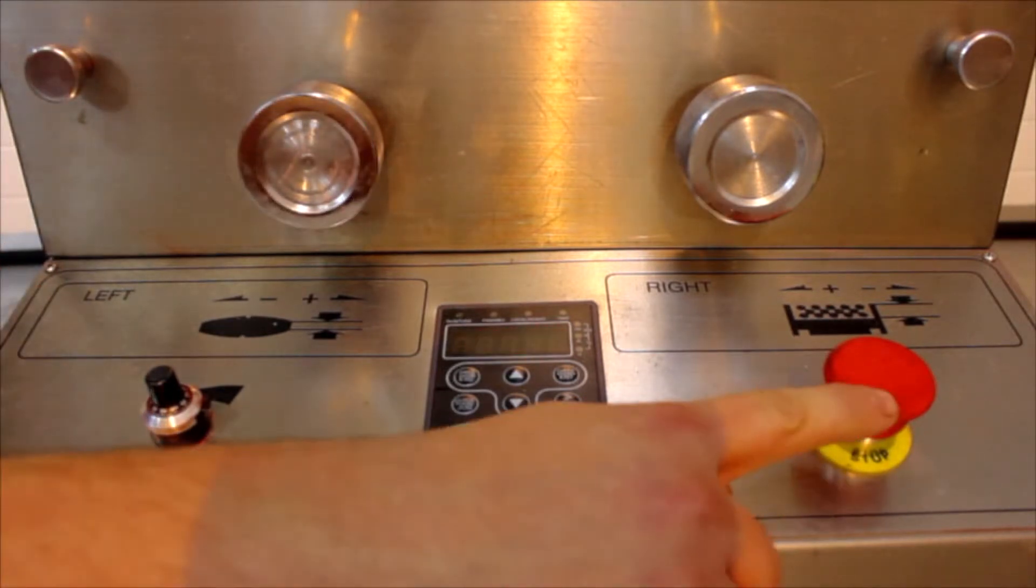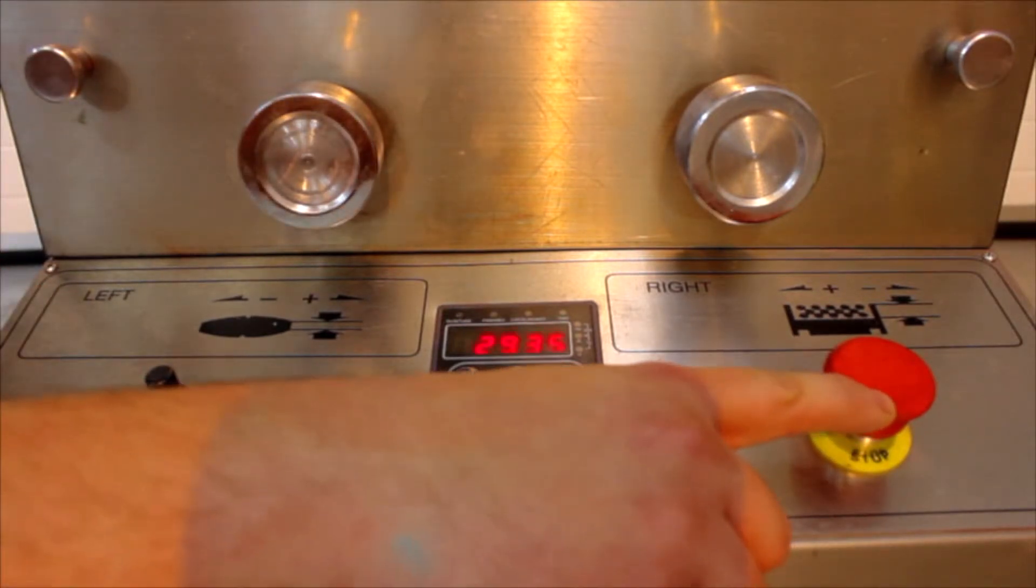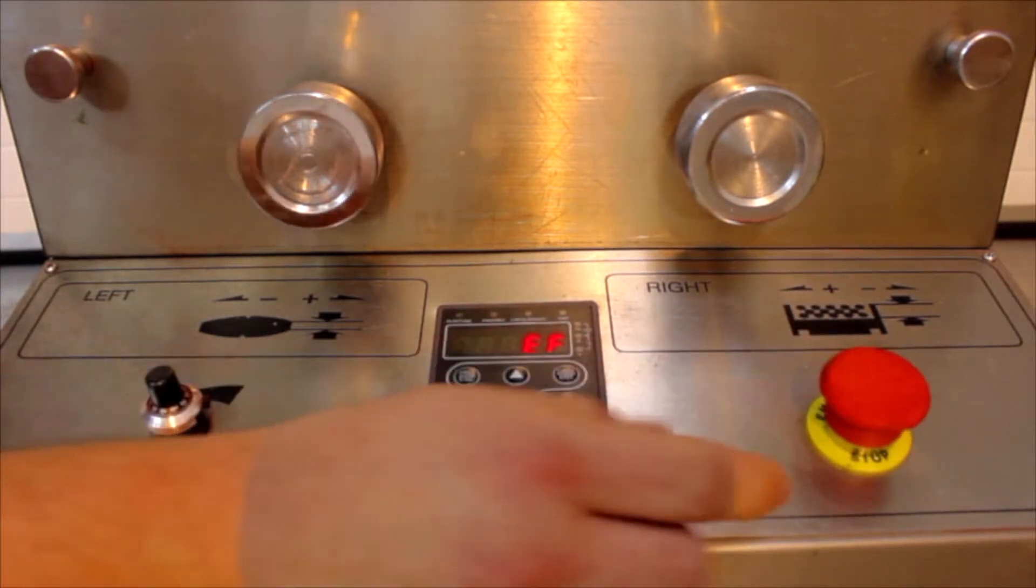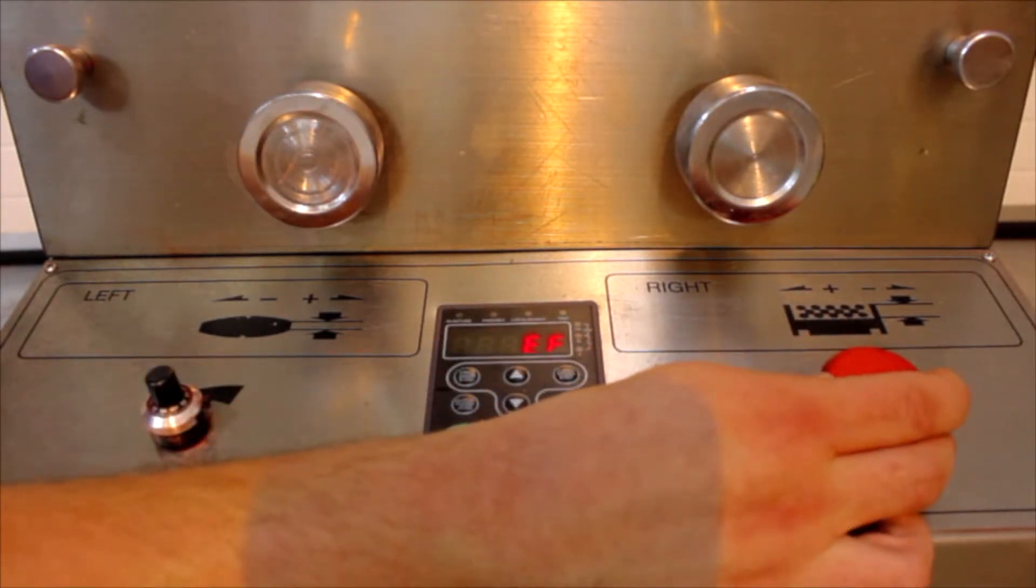The RTP 9 also comes with CE certified emergency stop button, which automatically kills the power to the machine.